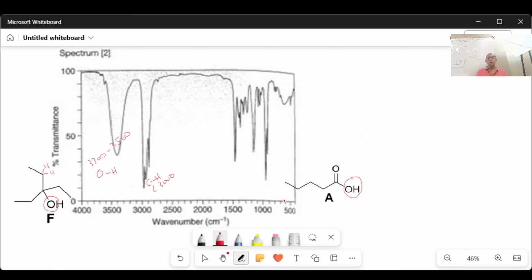You see those. So if you are given these two compounds, what is the best strategy? In these two, the main difference is that this is an alcohol, but this is a carboxylic acid. The carboxylic acid has this carbon-oxygen double bond, which is very different in IR absorption spectroscopy, meaning a carbon-oxygen double bond is from around 1650 up to 1800, where we see a signal for this kind of carbonyl oxygen.